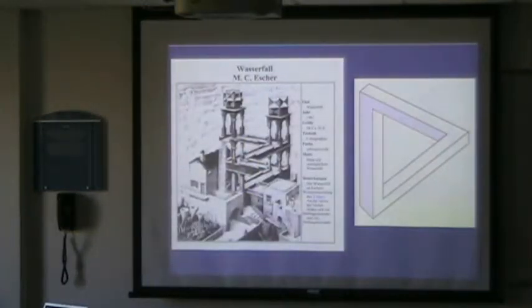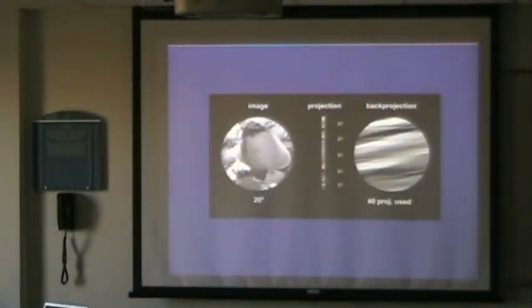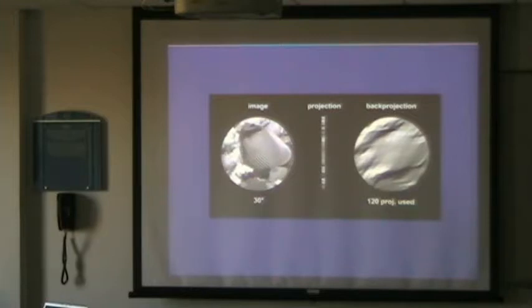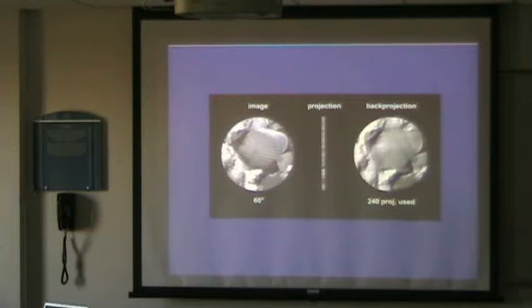Or then they painted like this, you know, and here the perspective looks sort of right, but obviously that's a misleading illustration, and the illustration is only possible in 2D, because you get fooled by the fact that this is actually a 2D image and not a 3D. The same thing is true for this. So it would be good if that would be true, but it's unfortunately not the case. So what we need is our different views, as I said, and then we can back project in space. And now in 2D space, we will do this, of course, in 3D space, and we get our image back.